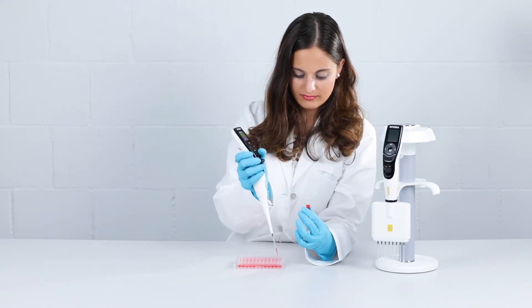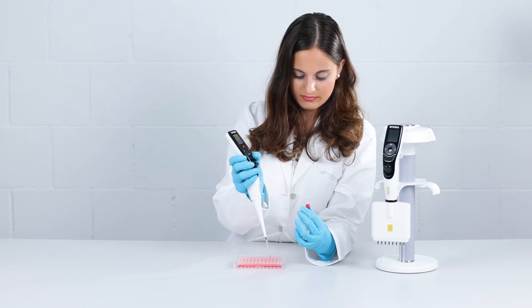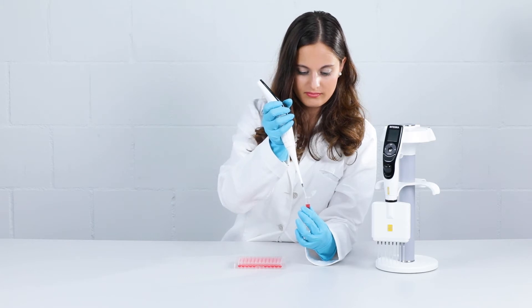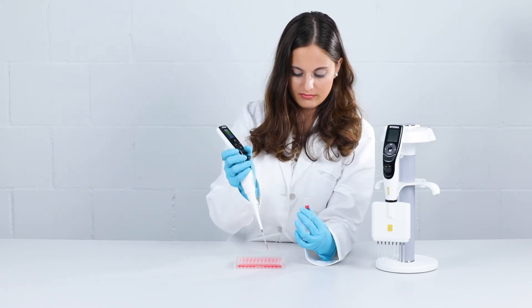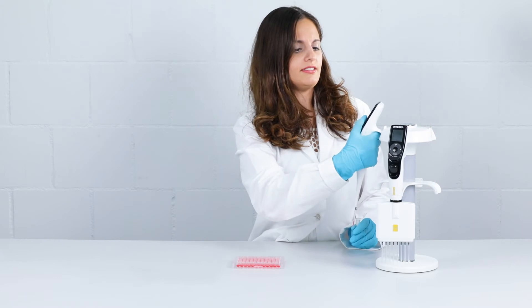But this requires pipetting from a tube using a single-channel pipette. This is not only time-consuming but also prone to transcription errors. Why can't there be a reservoir that offers low dead volume while still allowing users to transfer multiple samples using a multi-channel pipette?